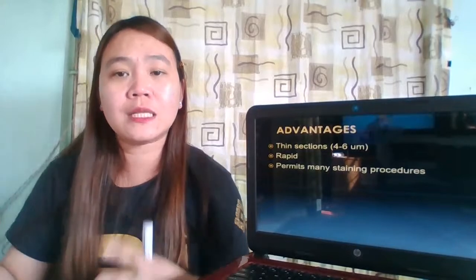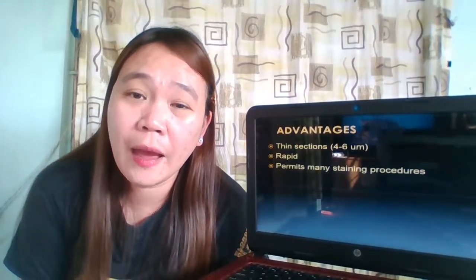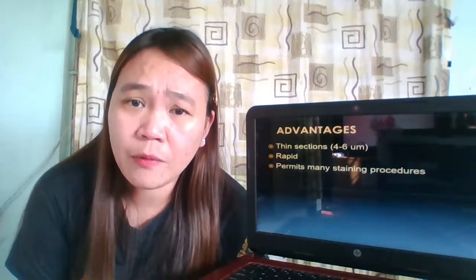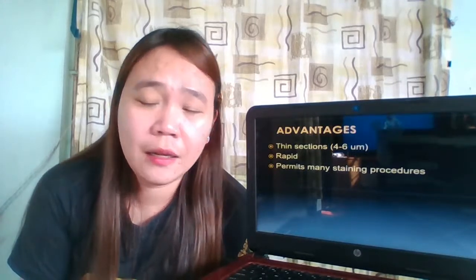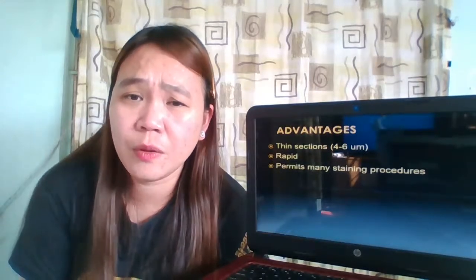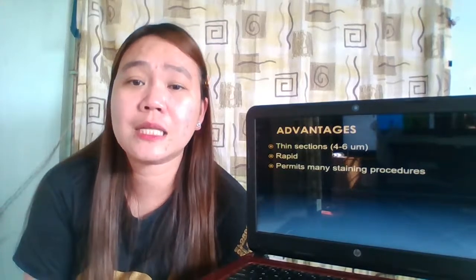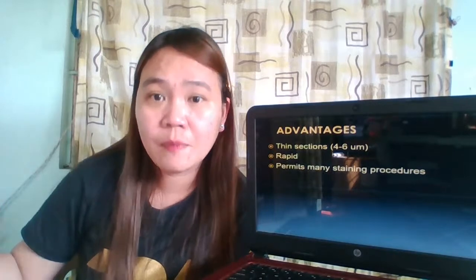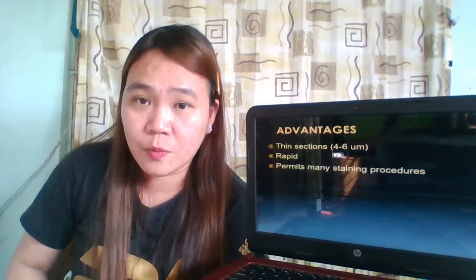So the entire process is rapid. Remember, in histopath, when we talk about rapid, 24 hours is already considered rapid. Unlike in the other sections of the laboratory, wherein rapid has to be within 15 minutes or 30 minutes, it's a different case in histopath because you have to perform a lot of steps before you have your sections ready for examination and interpretation.